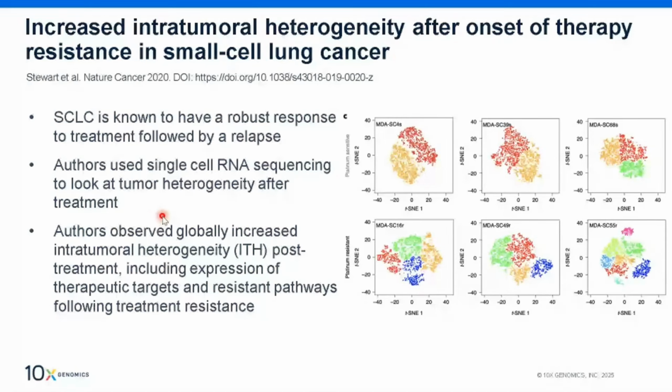Okay. So over here on top, these are examples of 3 samples of the tumor. Based on the single cell sequencing result and analysis, we can normally cluster it into 2 clusters of cells. This one is also 2, and this one we have 1, 2, 3 clusters of cells. So therefore, the heterogeneity of the cancer cells is not that high.